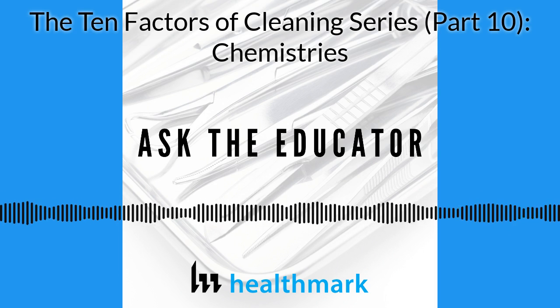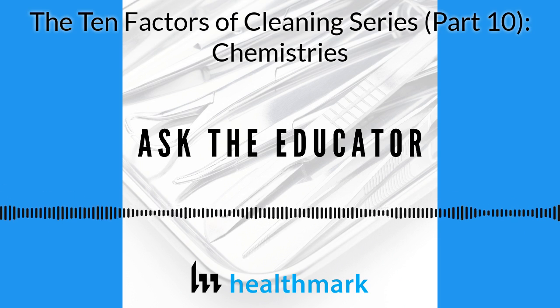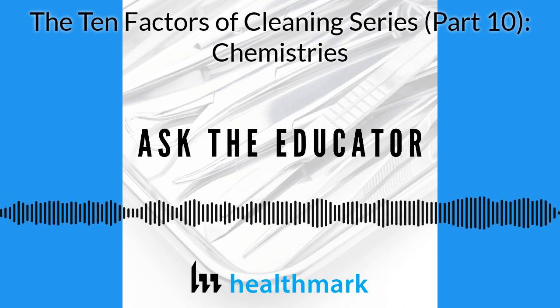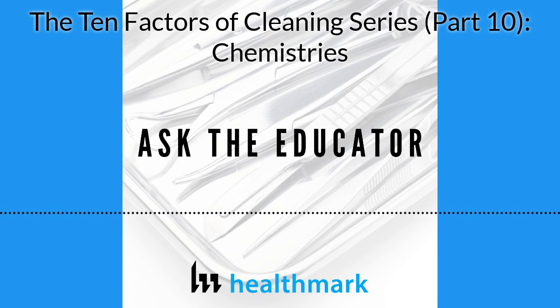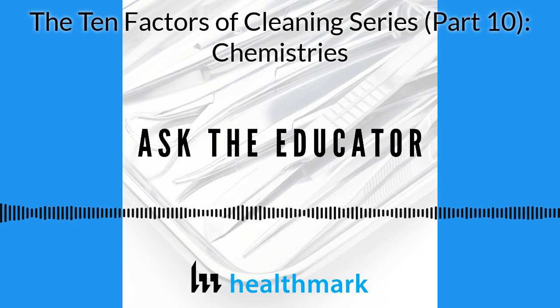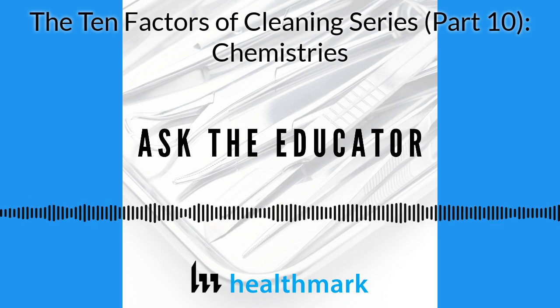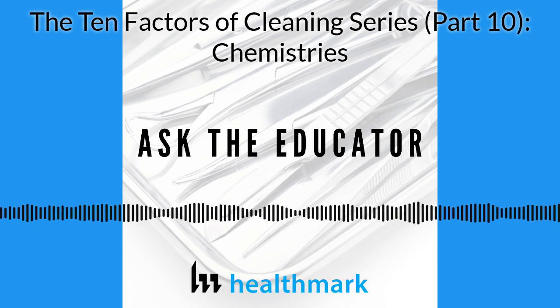So, in the cleaning chemistries, you've got to know your water and pH and temperature and how they interact. You've got to put it all together and know which enzymes, are you going to do low foaming or an alkaline in your washer. And it's very, very important. And if you get it wrong, you're going to have problems. And you don't want those problems. So hopefully we'll get people to start asking their cleaning chemistry companies some questions on how does it work and what tests have they done, independent, to show, and to go from there.